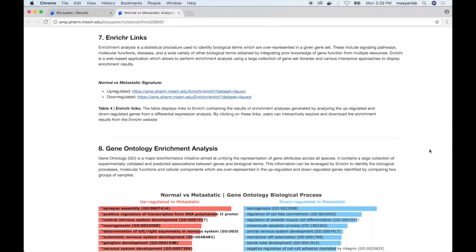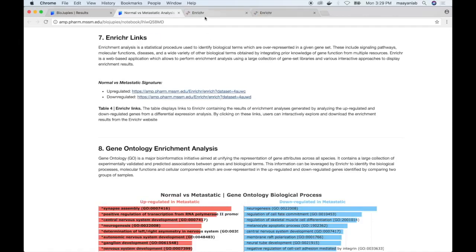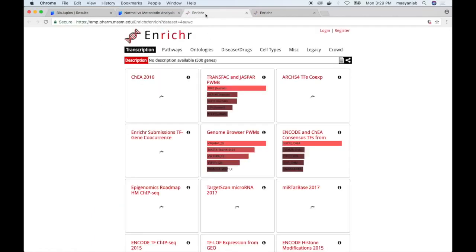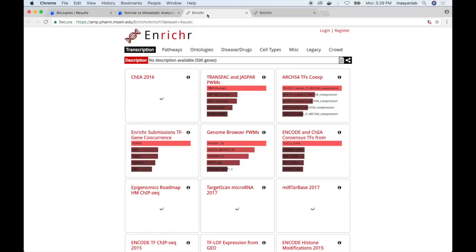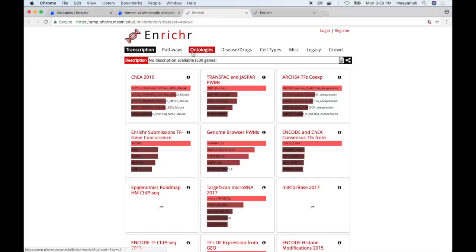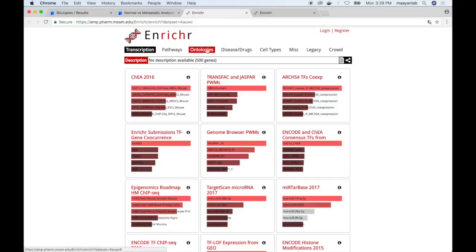Once the differential expression analysis has been performed, the upregulated and downregulated genes can be uploaded to the enrichment analysis web server Enrichr to identify biological terms overrepresented in each gene set. BioJupies provides links to Enrichr web pages which contain enrichment results for both upregulated and downregulated gene sets, which the user can interactively explore using the web server.